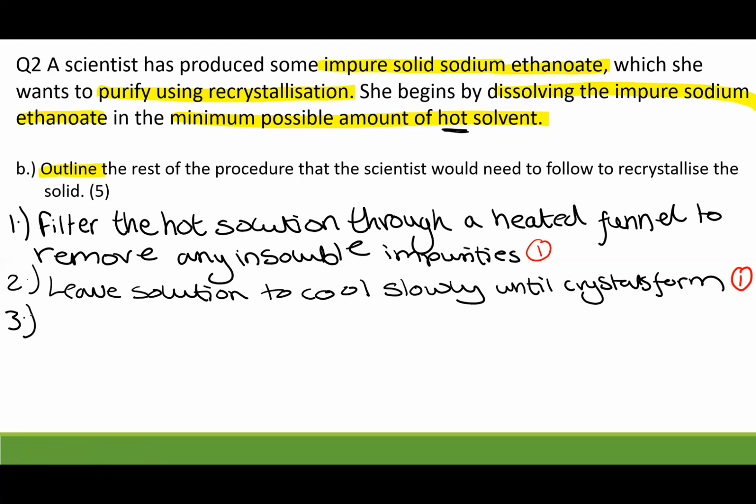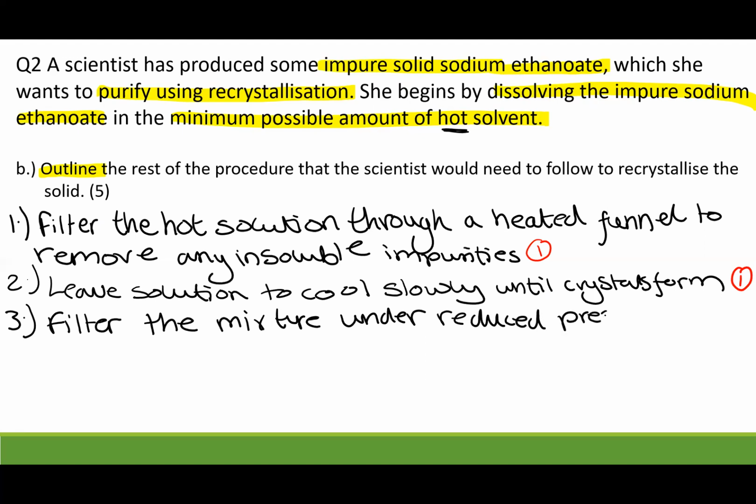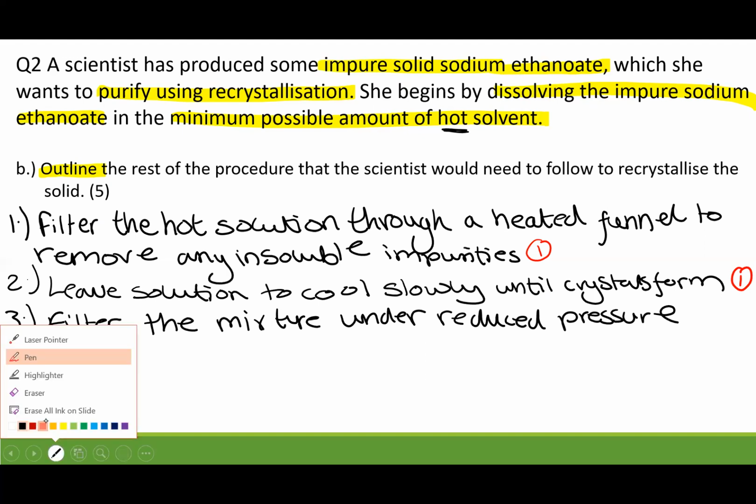Third point, we are then going to filter the mixture under reduced pressure. That will get you another mark.